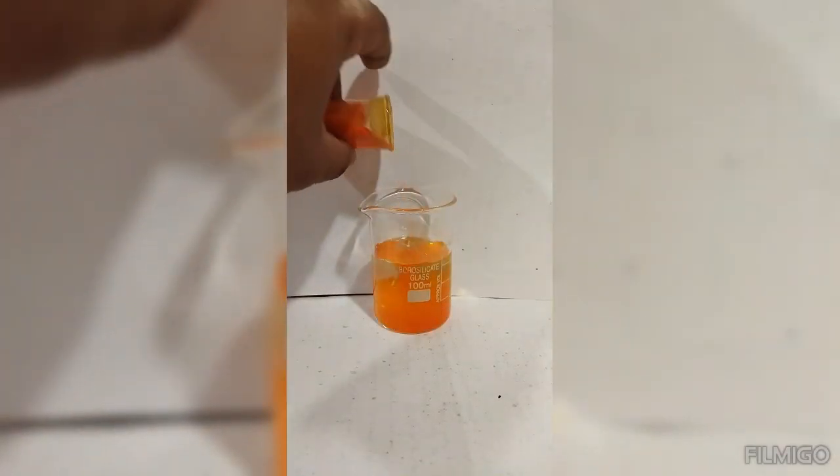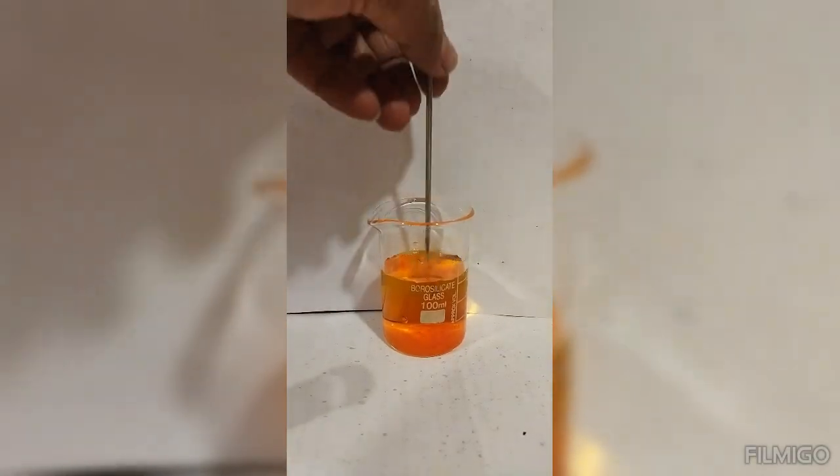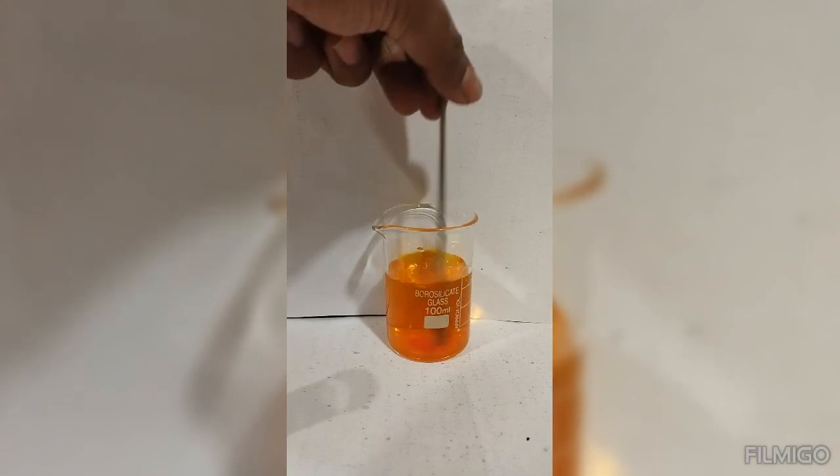First, we add potassium dichromate into distilled water and stir it for dissolving.